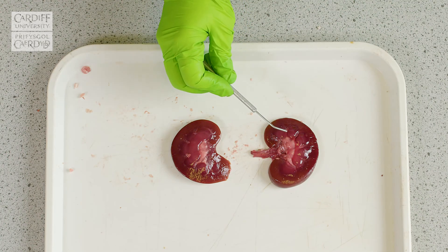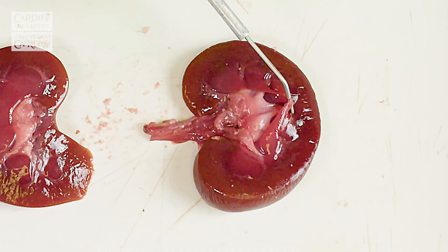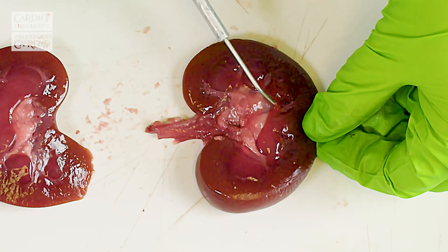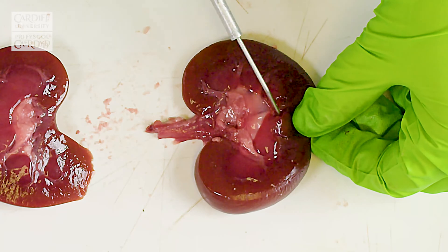So if I use my seeker now to show you, if I lift this part of tissue up, you can see how the structure is made up. You can see that the renal pyramid leads to these whiter structures, which leads to the renal pelvis.